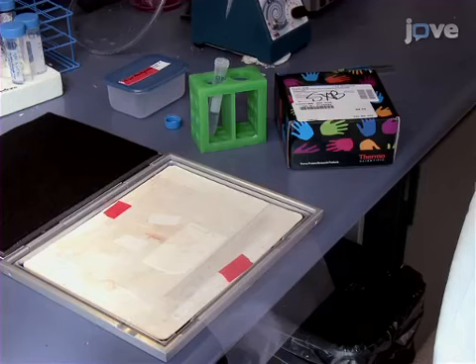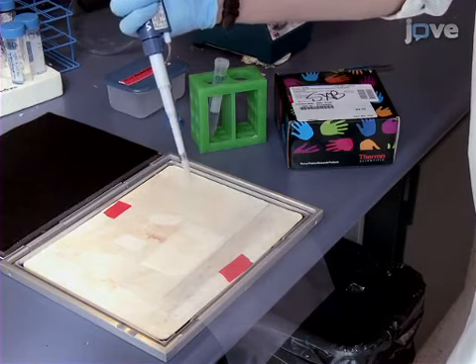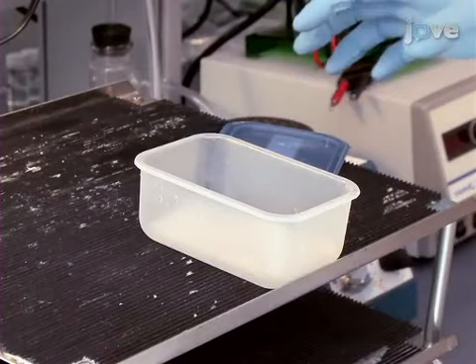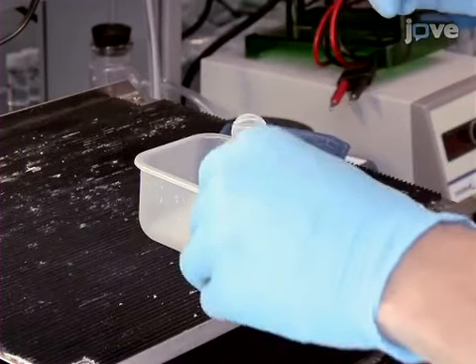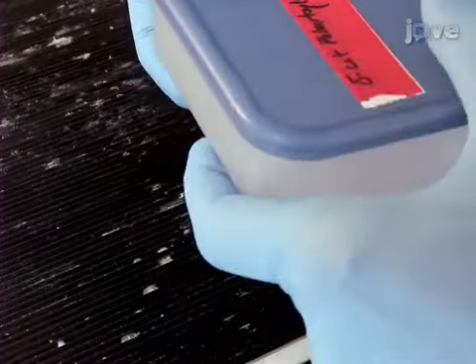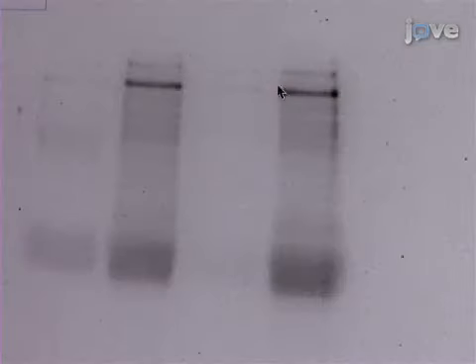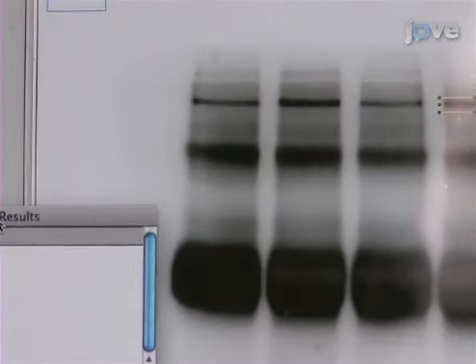In order to detect the palmitoylation signal, expose the HRP luminescence using a chemiluminescent substrate kit. In order to normalize palmitoylation levels to the amount of the protein of interest that was immunoprecipitated, strip the membrane using Western blot stripping buffer for 5 to 10 minutes on a rocking platform at room temperature. Repeat Western blotting steps using the primary antibody against the protein of interest that was originally used for the immunoprecipitation. Quantify palmitoylation of the protein of interest using image analysis software and normalize palmitoylation levels to the amount of immunoprecipitated protein.